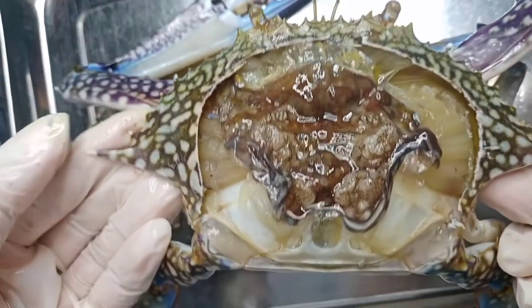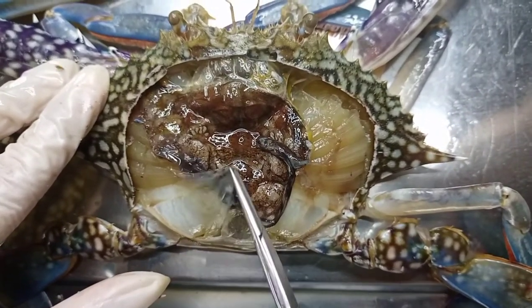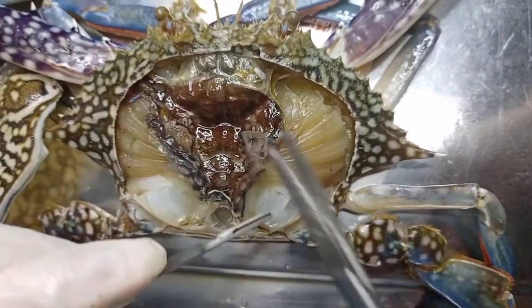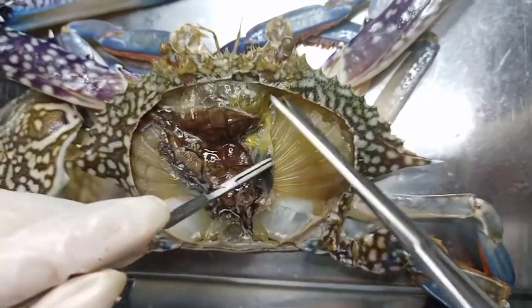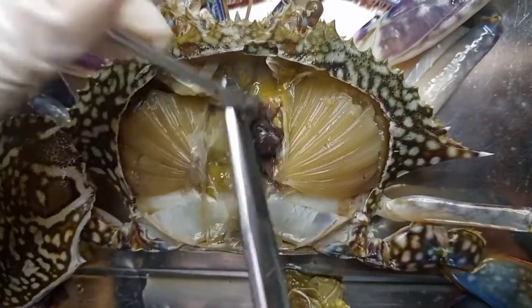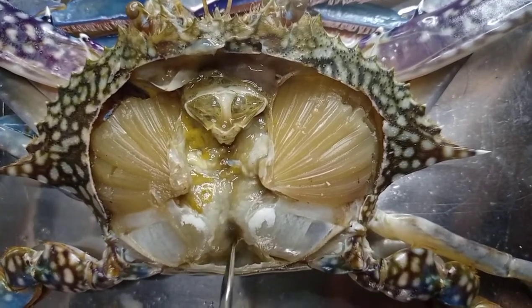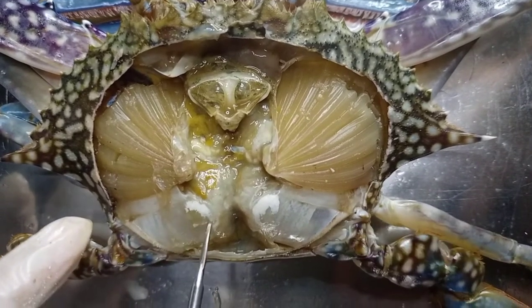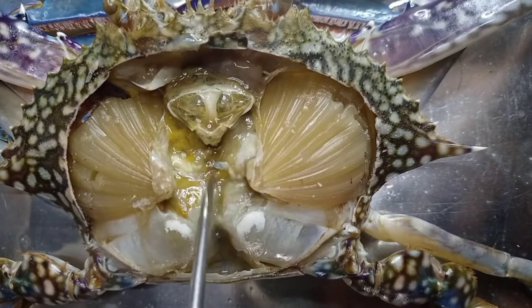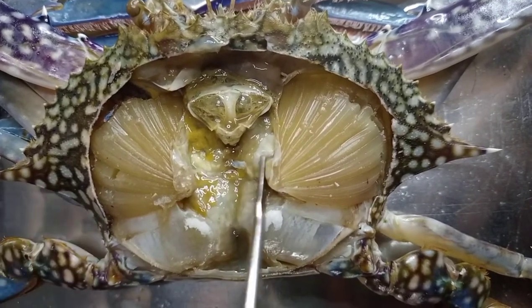Here are the internal features of the crab. Now let's remove the epidermis. This structure right here is the mid-gut. This is the flank. These are the gills of the crab. The heart of the crab lies here — this white structure here. These are the male gonads.